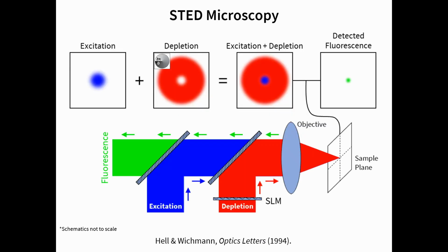Now, remember that in a STED microscope, you not only have to worry about the excitation beam, but about the depletion beam as well. And if the depletion beam becomes aberrated, the donut shape, which is crucial for effective super resolution, will get all wonky and it won't be able to squeeze down your fluorescence in the way that you want it to. Thankfully, for 2D STED experiments, the 2D depletion donut that is generated by this vortex phase pattern here is relatively robust to aberrations, meaning that it can maintain its donut shape pretty well, even in aberrating samples. So you can do 2D STED tissue imaging experiments at about conventional confocal imaging depths with relatively little issue.